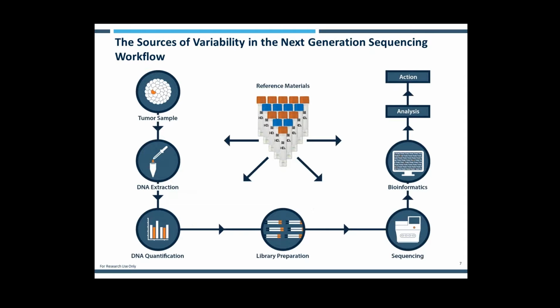Now, what does any new technology bring? Well, new technology is there to bring you a lot of good things, and the challenge of any new technology is the variability and understanding the full workflow, so you can mitigate any problems that can arise at each of the steps. As this is a nice little workflow. You've got your tumor sample, you extract your DNA, you then need to quantify your DNA, it goes through a library preparation step, sequencing, and then there's bioinformatics where you analyze and act on it.